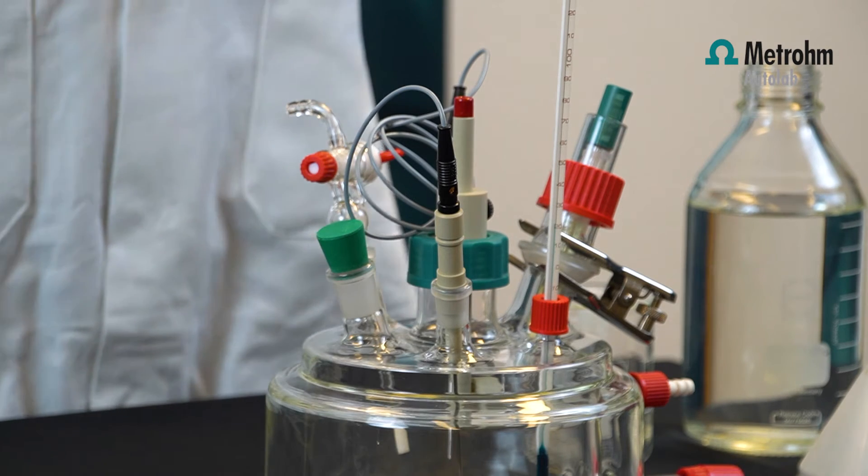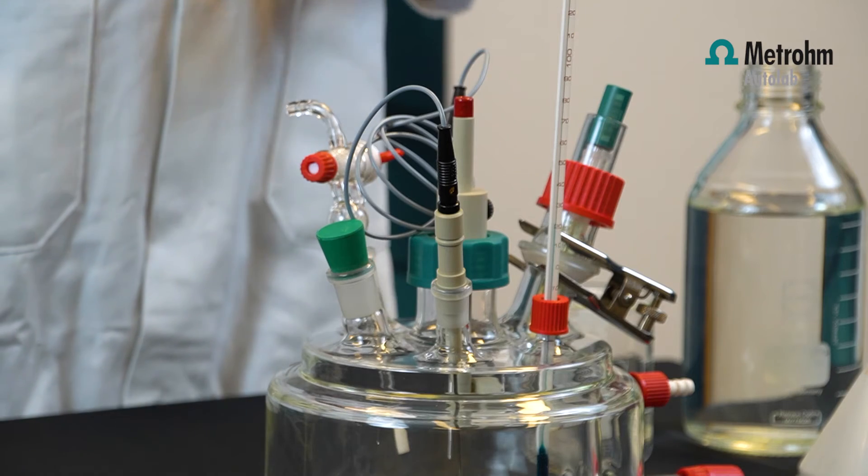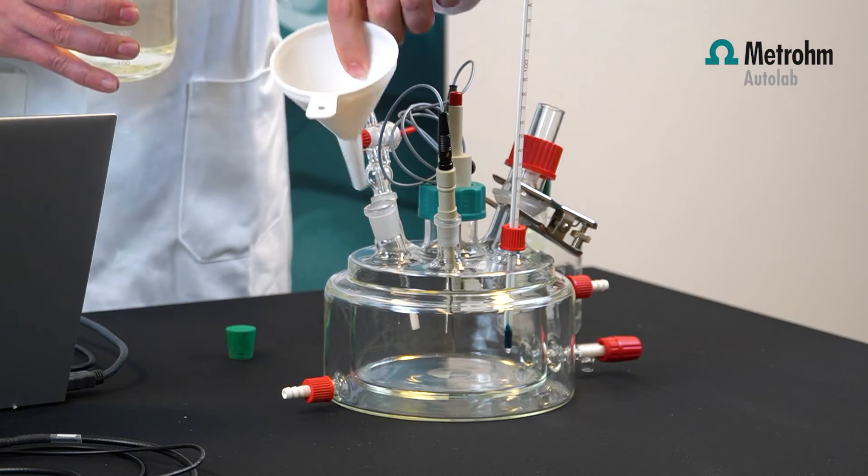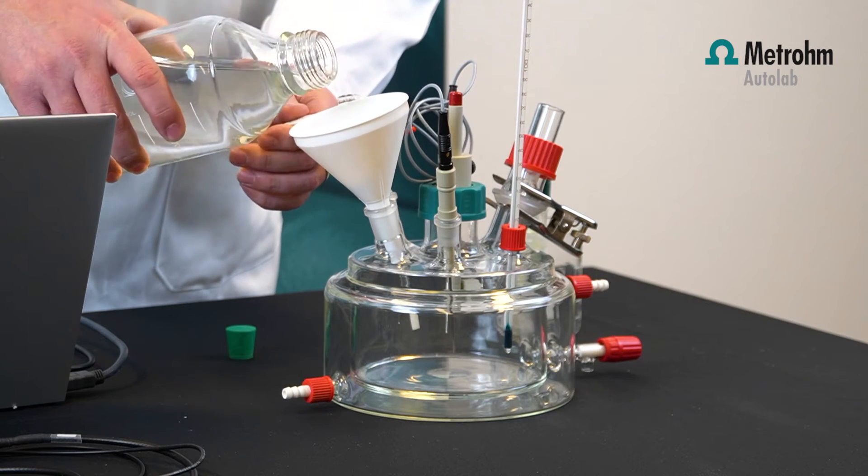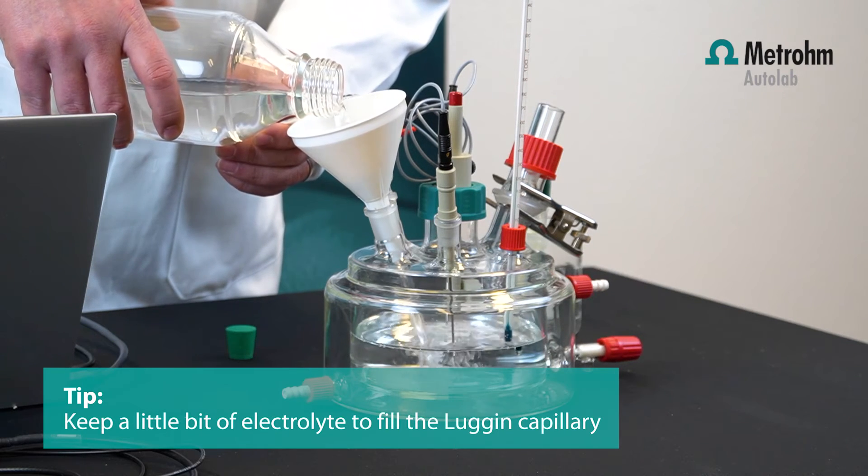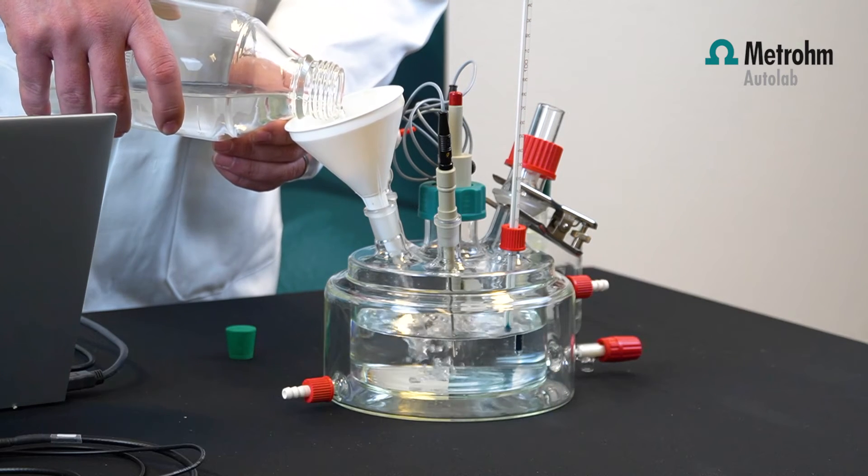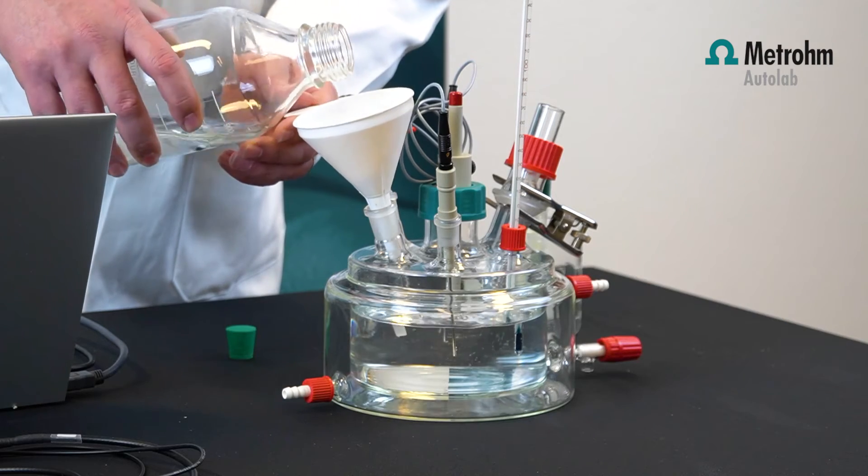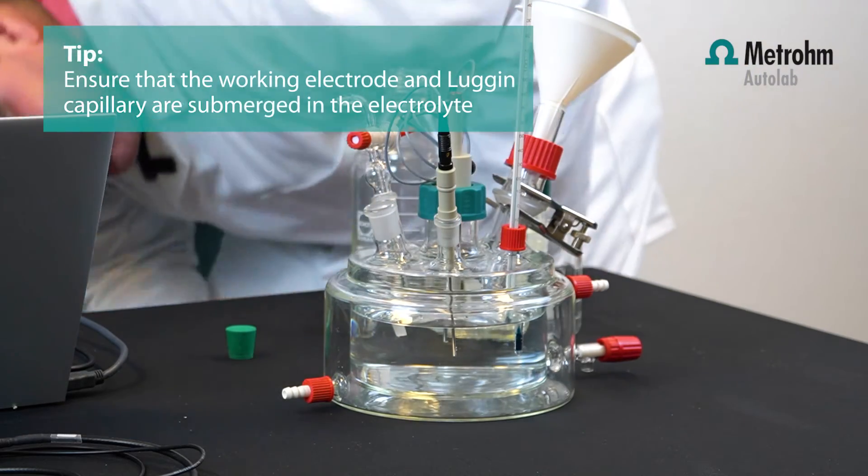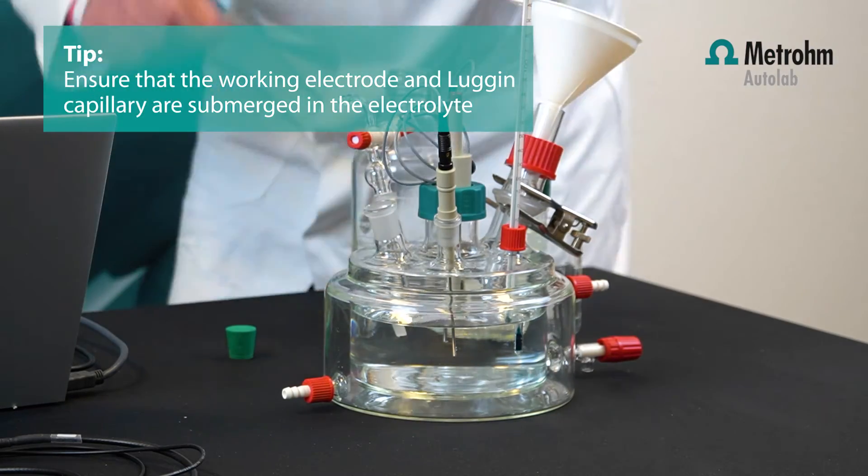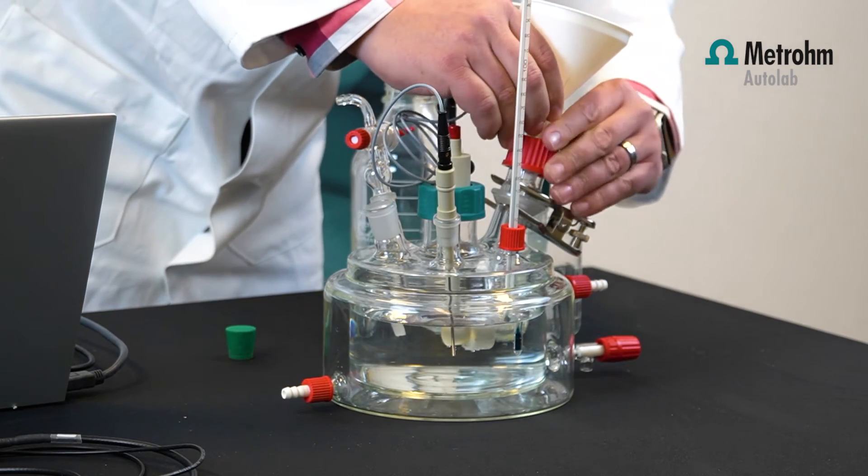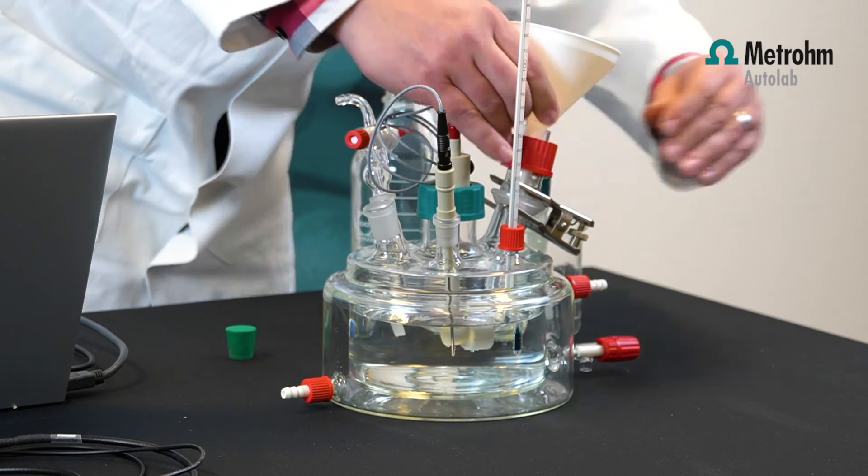The electrolyte is going to be seawater which is a sodium chloride solution. We're going to fill the cell with this seawater. Fill the corrosion cell with one liter seawater. Put a funnel inside the corrosion cell and just pour roughly one liter electrolyte in the cell. Be sure you keep a little bit left over for the Luggin capillary.